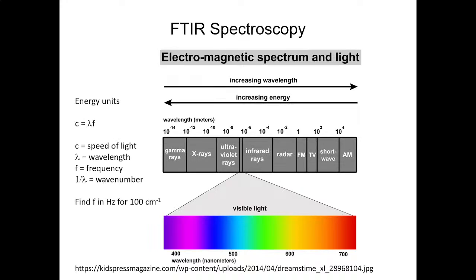So, I'll probably come back on camera after this slide and talk a little bit about some of the movements that the oscillators and the rotors do that help them to absorb infrared. First of all, though, I just want to place infrared into the context of a lot of the different radiation types that there are.